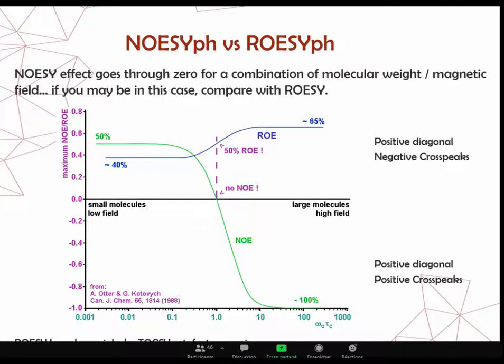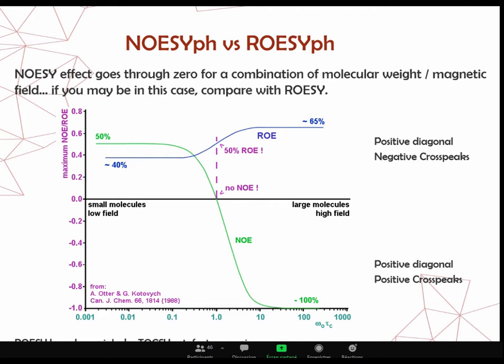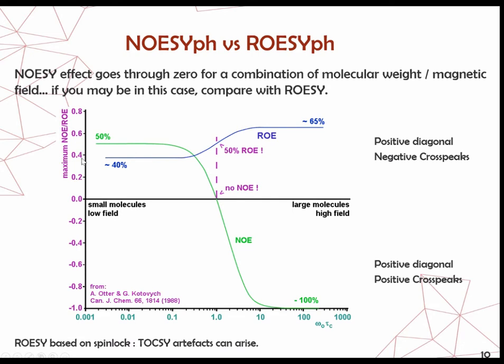If you have equilibrium or maybe associations between intermolecular association, in some cases it can be tricky. Even if I don't have the exact molar mass of the compounds, usually in the lab with the 500 megahertz spectrometers, we are still in this area. And a quick second question: if I want to do a NOESY, do I have to see you or?